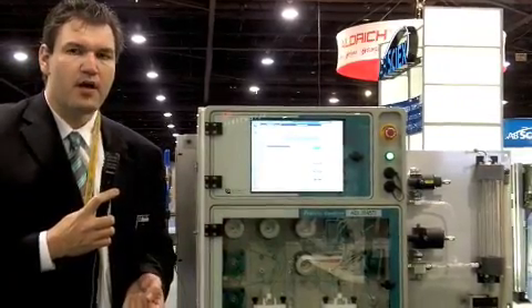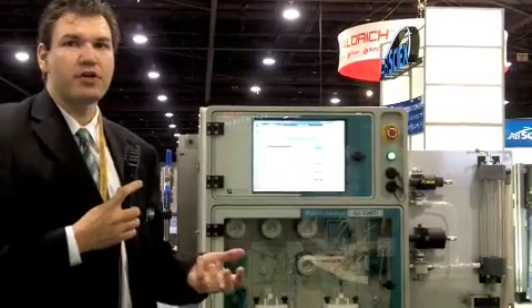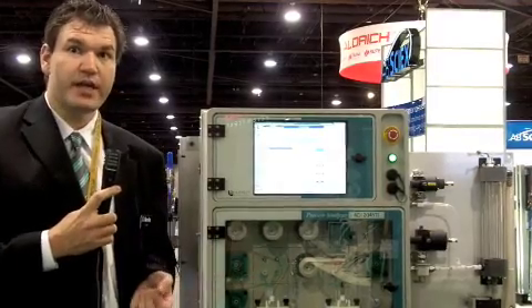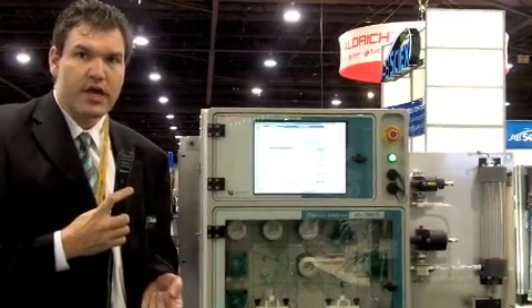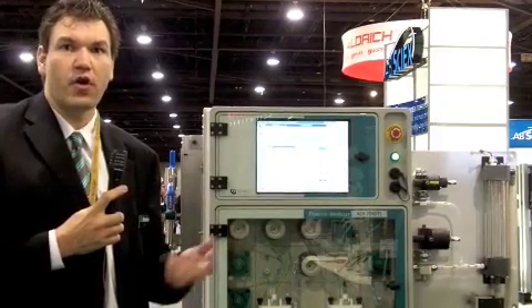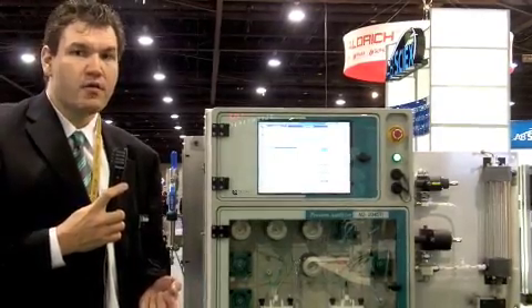These applications can be found in the semiconductor industry. In mining, for example, there is analysis of effluent waters, including analysis of heavy metals in effluent waters, as well as acid mixtures in all kinds of different processes. We also have applications for the petrochemical industry.